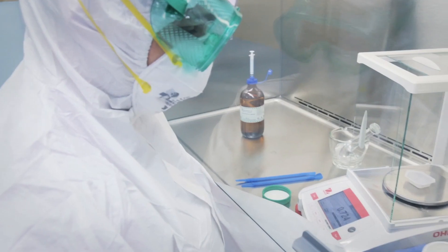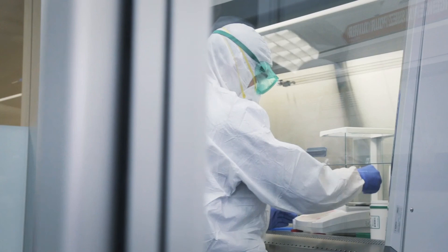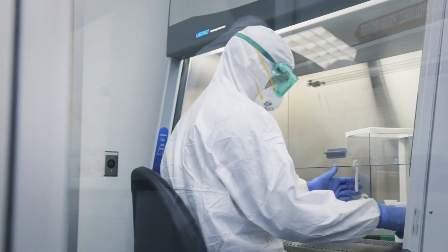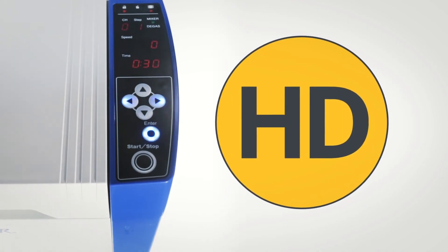Pharmacists can also rely on the MESS when compounding hormones or other hazardous drugs as the machine meets USP 800 requirements.